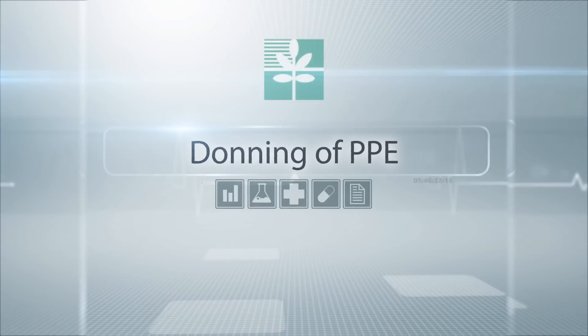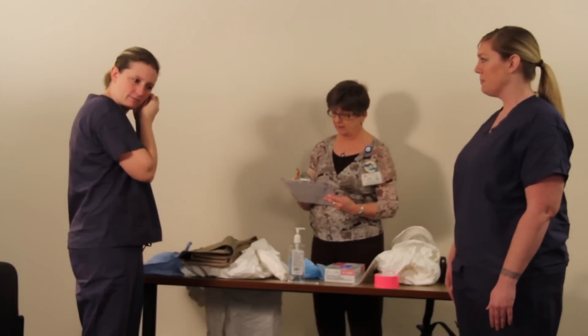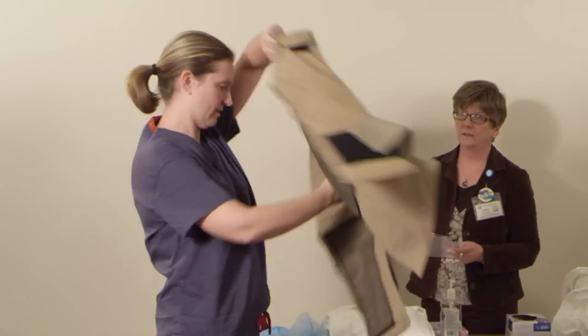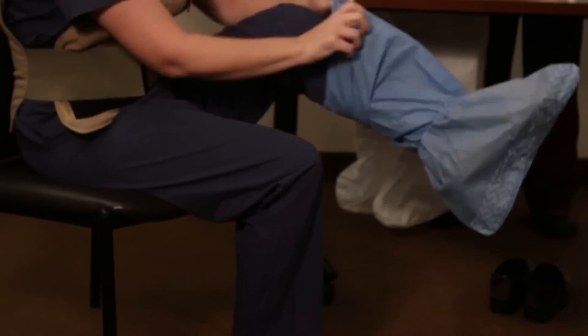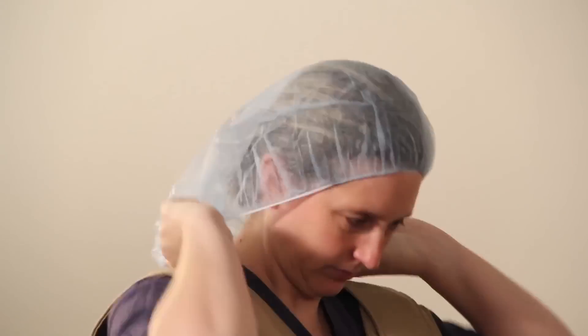Donning of PPE. First, remove your clothing, jewelry, and accessories. Then put on your hospital-provided scrubs, shoes, and if desired, your cooling vest. Place tall surgical booties over your hospital-provided shoes and tape them to your scrubs. Pull your hair back and put on your hairnet.